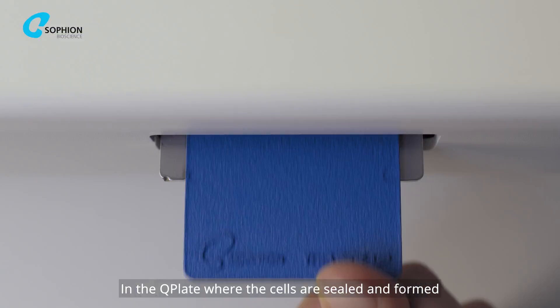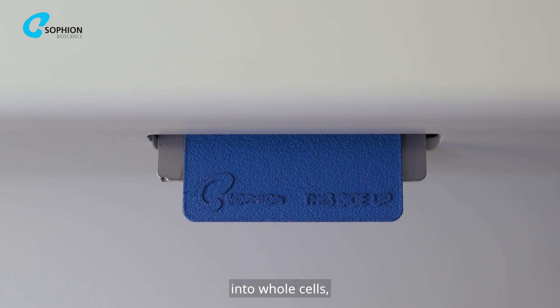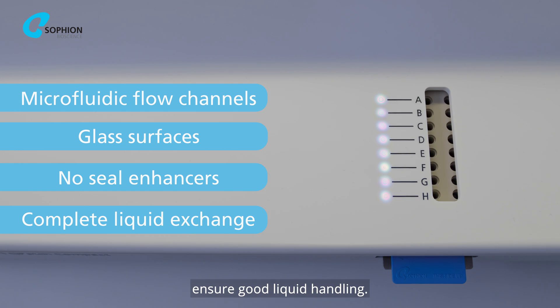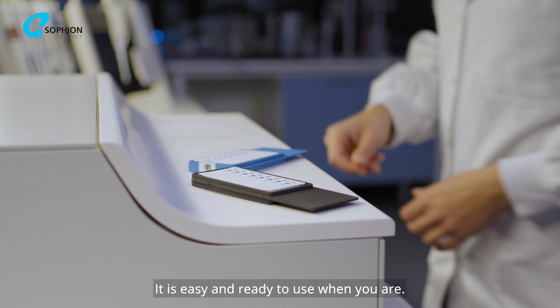In the Q-Plate where the cells are sealed and formed into whole cells, microfluidic flow channels and glass surfaces ensure good liquid handling. It is easy and ready to use when you are.